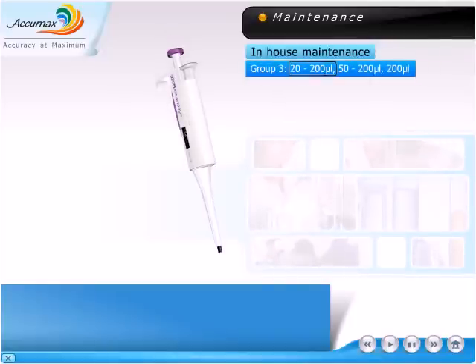Group 3: 20 to 200 microliter, 50 to 200 microliter, and 200 microliter.